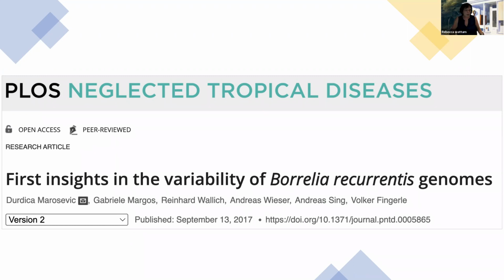And where I could find many papers, there was an excellent one on Borrelia burgdorferi that I really wanted to use, doing a SNP analysis, but they were only in contigs. And to find something that had freely available data that were in reads, I had to step up a bit. And still, this is an interesting paper, and I think you'll like it. And then you can use it as a model for your own analysis using tick pathogen.